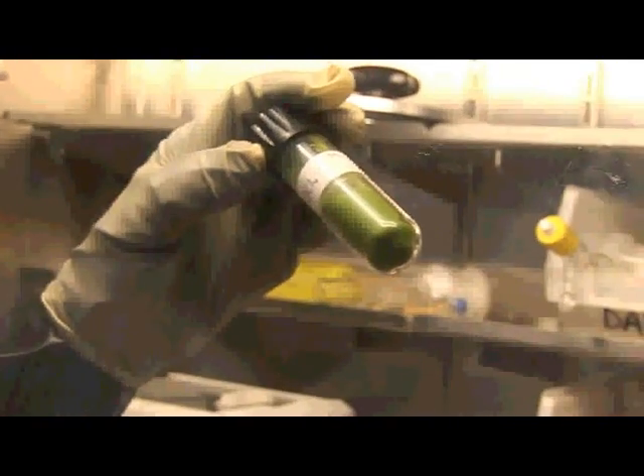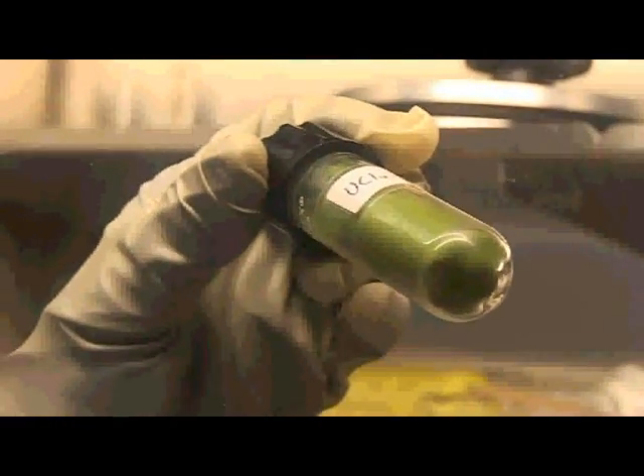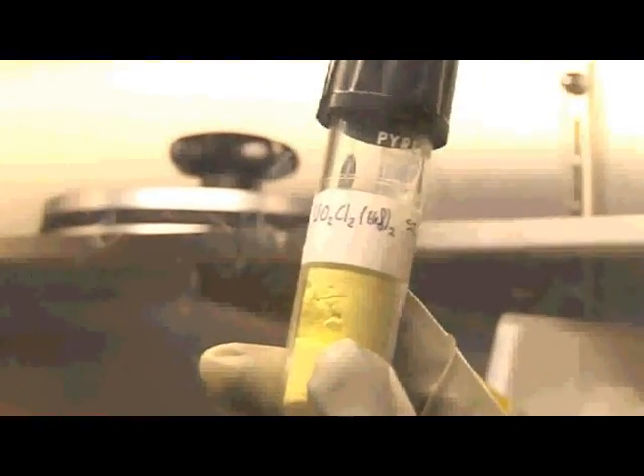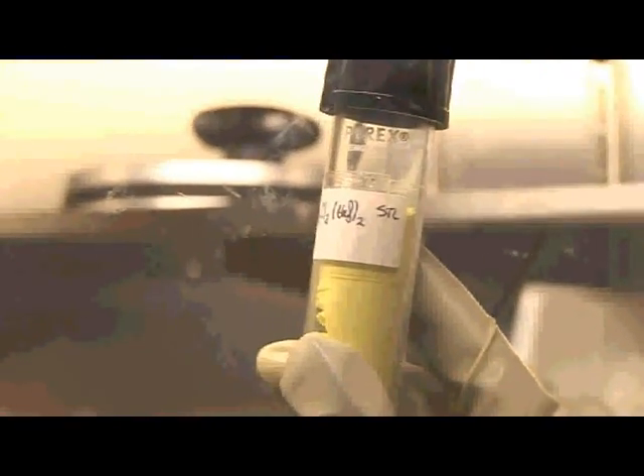This is uranium tetrachloride. It's solvent-free — it's a nice free-flowing emerald green powder. And if you dissolve this up in solvents like THF, you get beautiful green solutions from it. And here's another form of uranium — this is uranyl dichloride, which has got two organic molecules coordinated to it as well. That's this beautiful yellow colour.